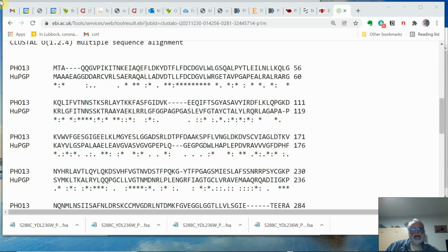Everyone, continuing on the theme of little short videos to help you along with the various assignments and experiments we do, I'm going to show you a new alignment tool that makes some changes to the alignment you did so that maybe it's a little easier to interpret.